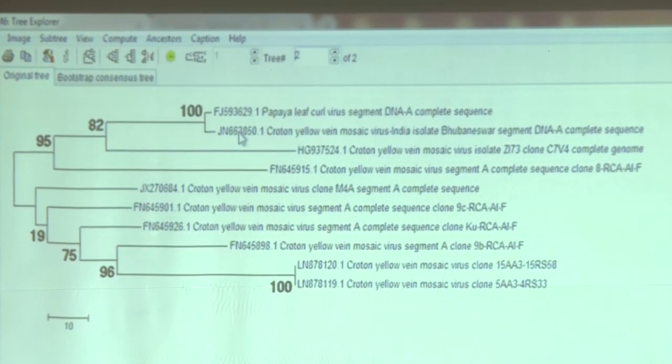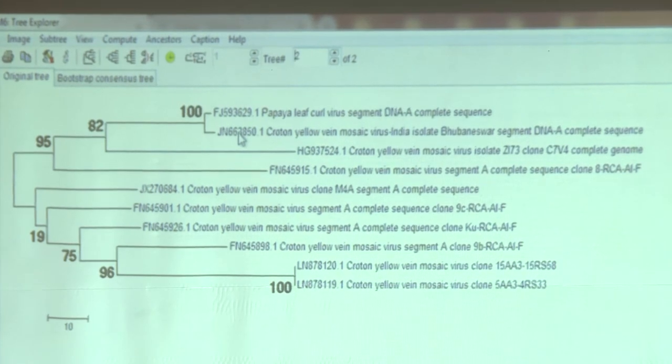I think with that we will conclude this molecular phylogeny practical. We started at 10 o'clock. We had two sessions on that. The first session was all about flat files. We started from a flat file this morning, and we ended up with multiple files after doing BLAST analysis. From there, we carried forward our practicals into molecular phylogeny.